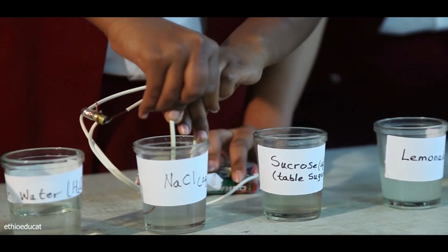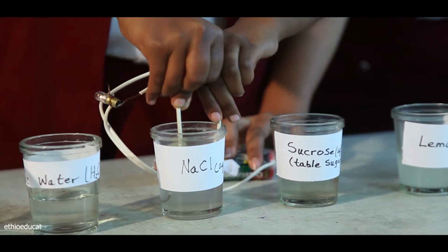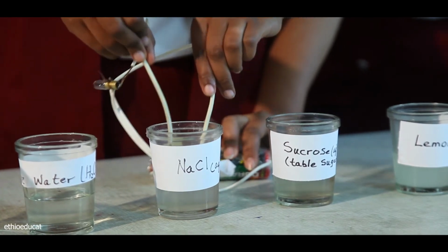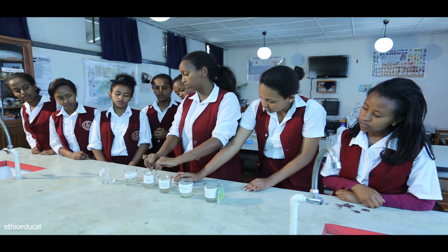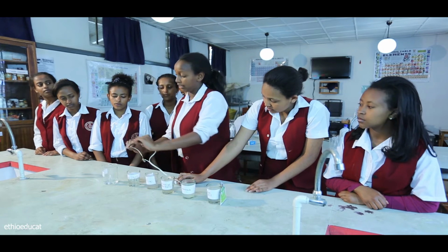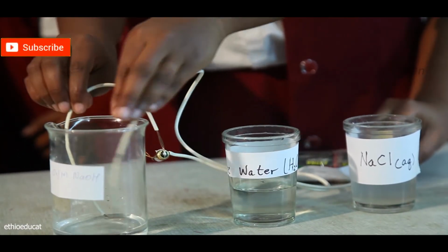Are you seeing a little light coming from the bulb? Yes. It might be small, but it's still coming. It's maybe dim because of the concentration. We have only taken a small amount of the solution. That's why maybe it's dim. But the bulb still has light, so that means that sodium chloride is an ionic compound.